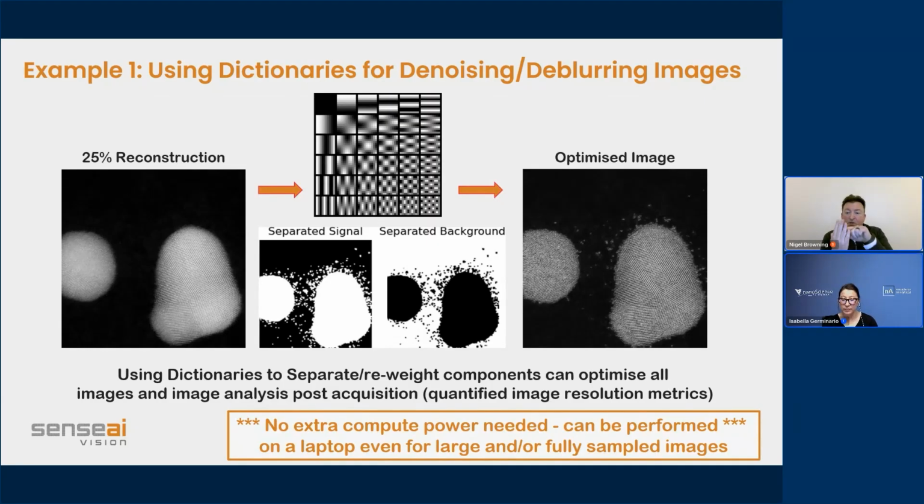That means the time resolution of our spectrum is about the frequency at which the spectrum moves across the detector. For any data cube where you're acquiring an EELS map, you're just moving the spectrum, and you get the resolution of the moving of it. What that means is you bunch all the signals together, you can then use a dictionary for the whole thing, and you can use the signal to noise of the whole signal rather than each of the individual spectra. So that is a benefit of getting EELS in that way.